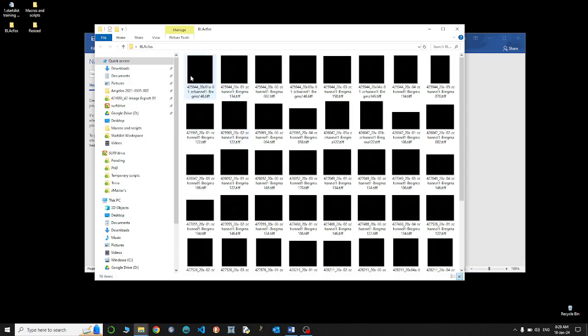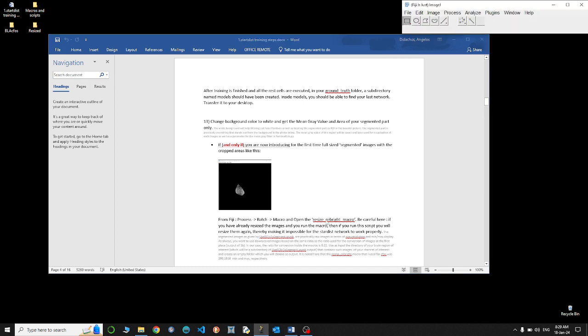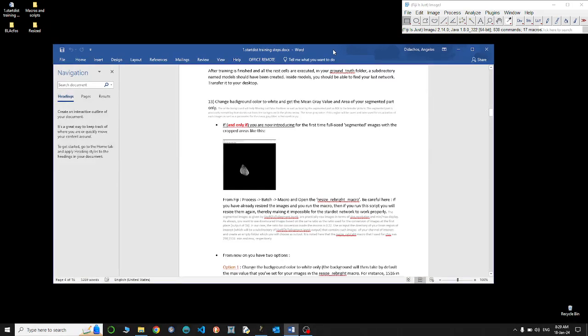So these are my images. As you can see, they're large, half a gigabyte each, and they contain the amygdala. So what I want to do now is to resize these images and also rebright, like change their brightness. First of all, we should clarify that we're not really changing the brightness in the image. We're just changing the display brightness.